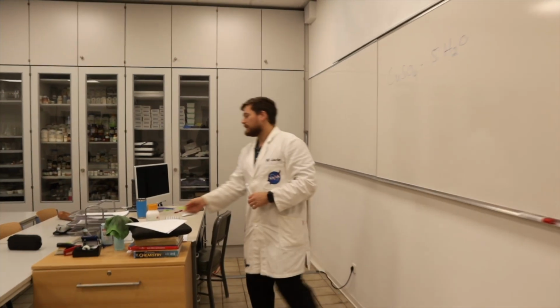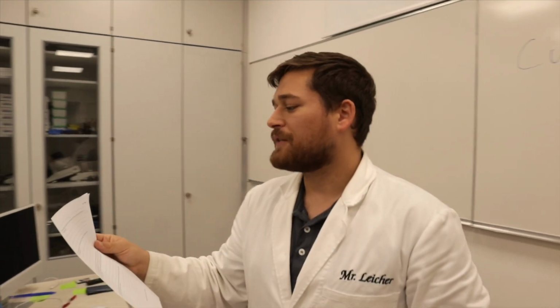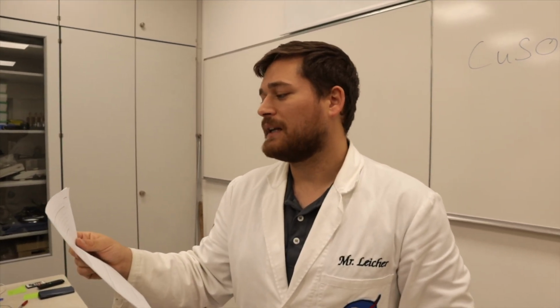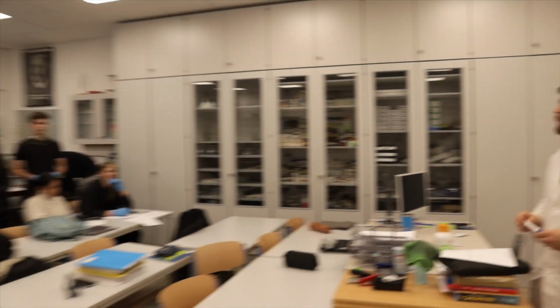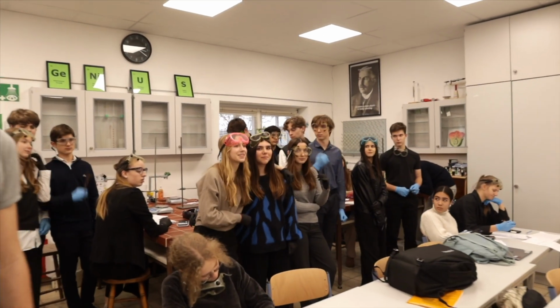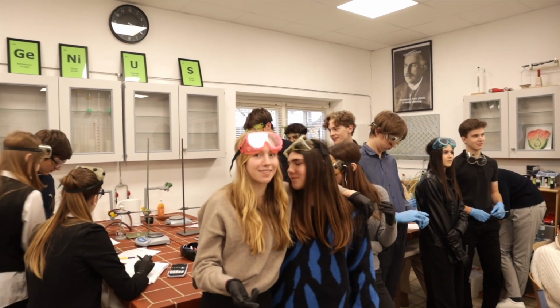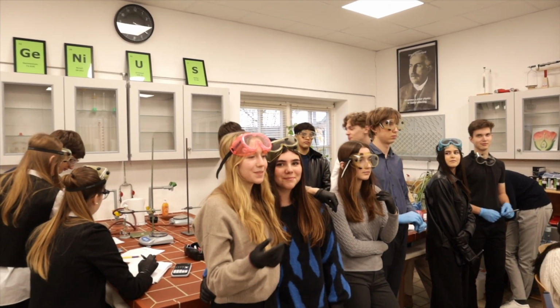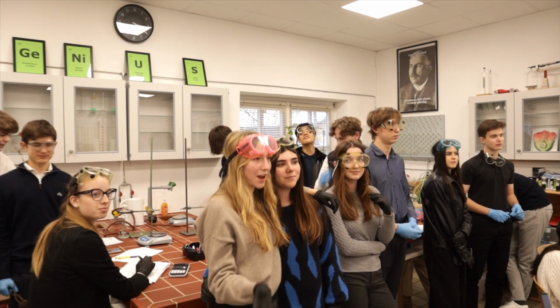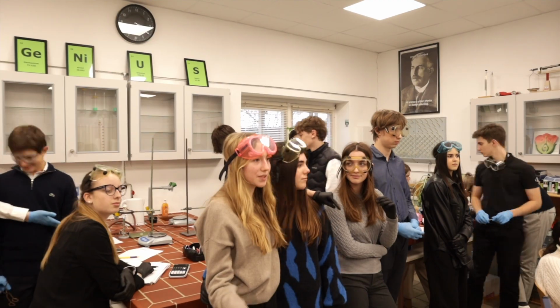So the question on number 4 said, would you expect the number of moles of your hydrated copper sulfate and the number of moles of your anhydrated copper sulfate to be the same? Why or why not? Who answered that already? Chantel? It stays the same because when the water evaporizes, the molar mass changes and the grams changes. They both change. So when you calculate it, it would still be the same.